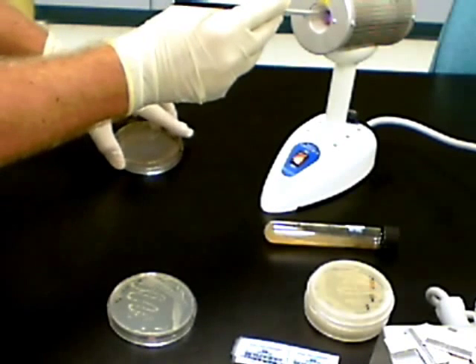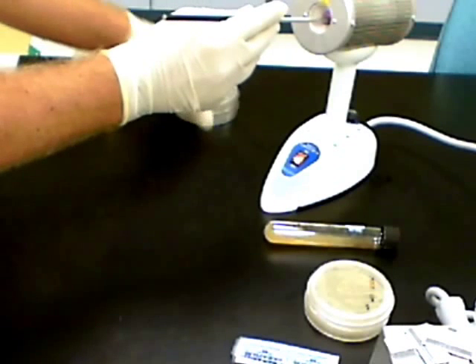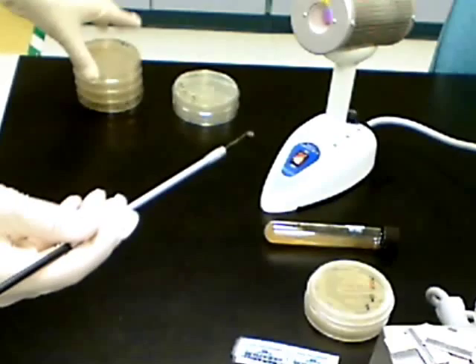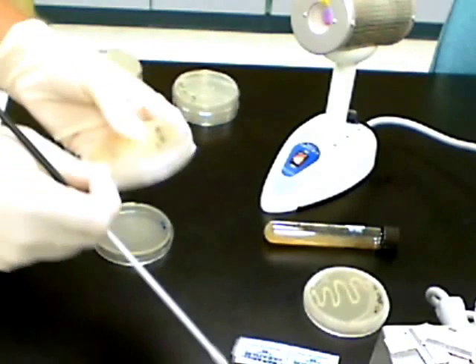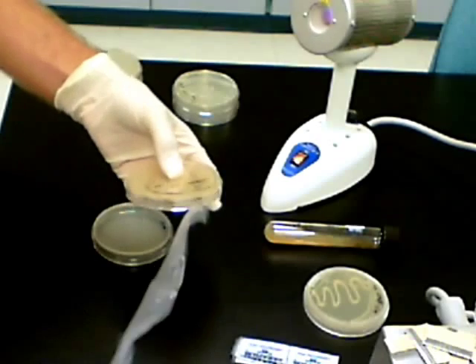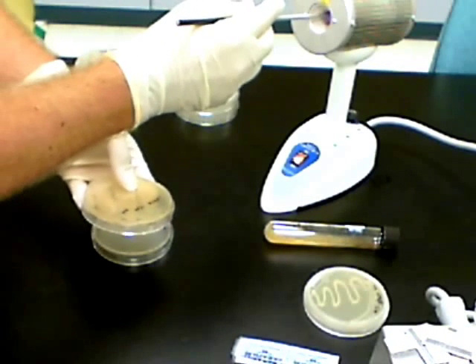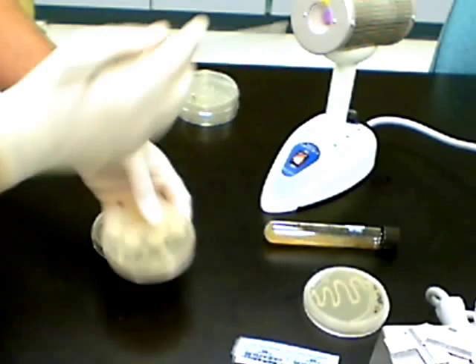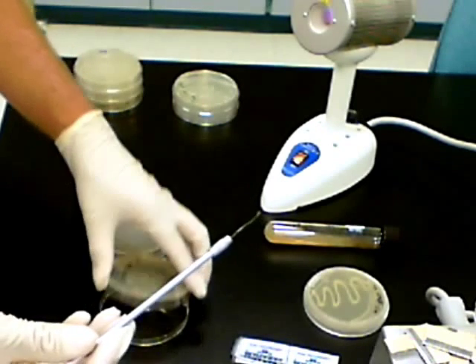Then replace the cover of the plate and sterilize your loop in the bacti-cinerator. You'll want to work with your agar plates upside down because it's easier to pick them up and do the transfers from the original medium to the fresh medium. Here you'll watch the procedure one more time, and you can repeat this procedure for as many bacterial cultures as you need to subculture.